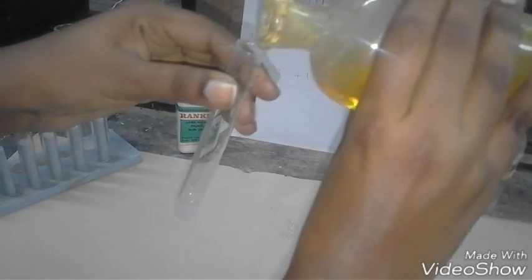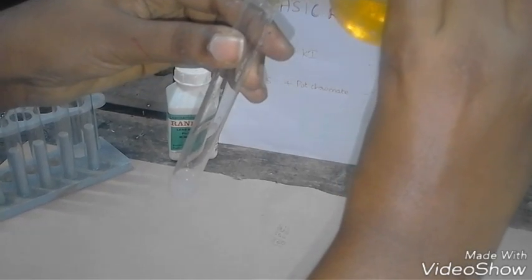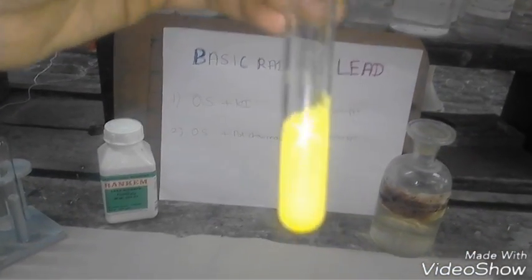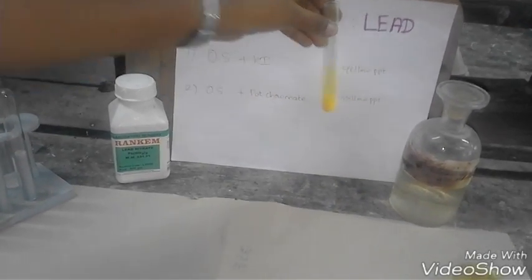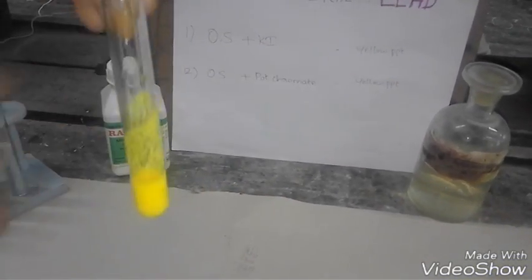When we add a little amount of potassium chromate into the original solution that we took in the test tube, it becomes bright yellow in color. This yellow color is a little bit lighter than the first yellow precipitate.